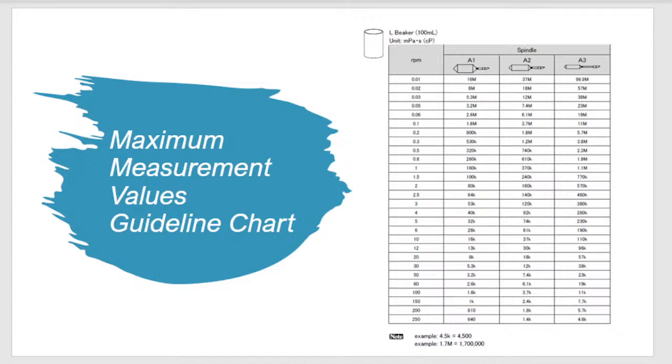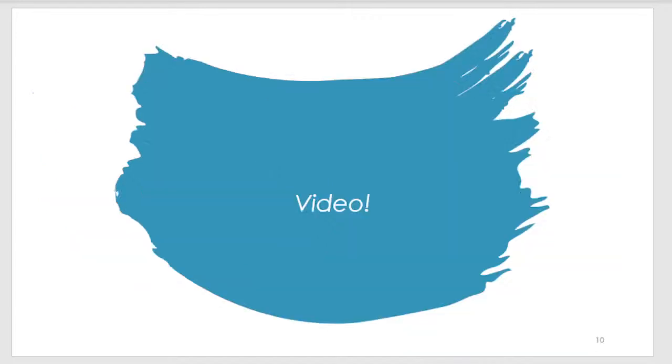For me personally, 20 and above is good torque. So as long as you're getting 20 above torque with a certain RPM and a spindle, then that's the area you need to be at to get the right accuracy or result of your viscosity of your adhesive.